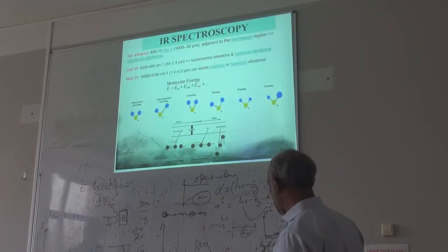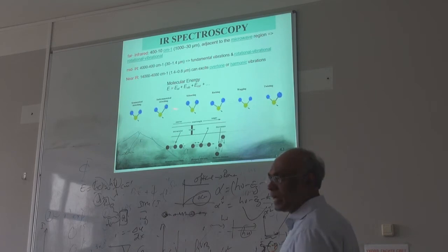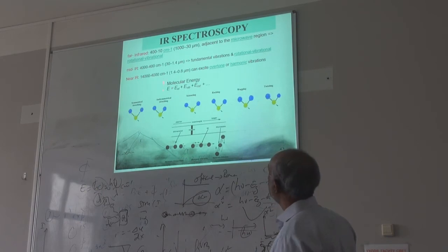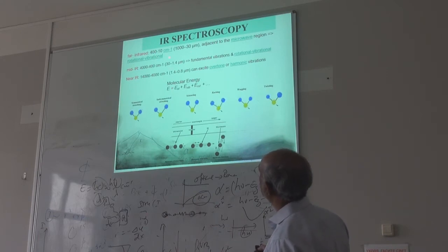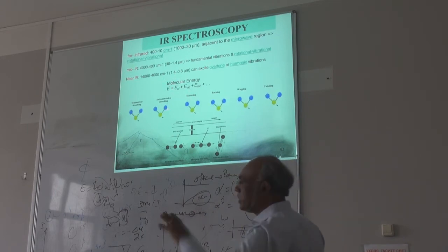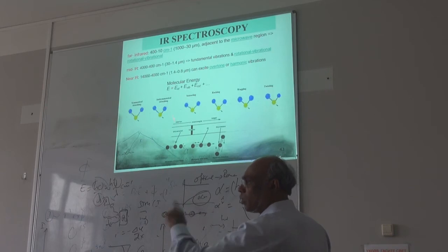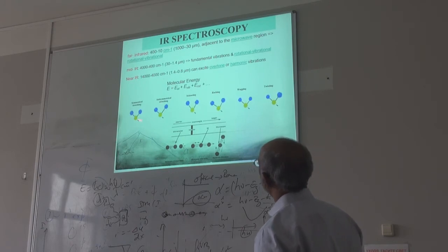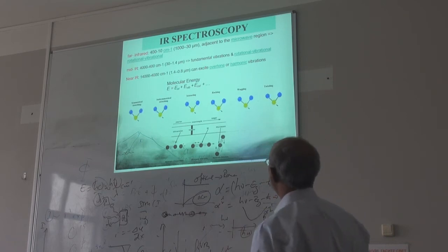Okay, so the last thing is IR spectroscopy, infrared. These are mostly looking at features happening in the infrared range, going to your micrometer scale, right? So they are mostly looking at vibrations, electronic transitions, vibrational and rotational, all these things. So you can see some of the IR vibrations. You can have symmetrical and asymmetrical, we call the scissor mode, rocking mode.